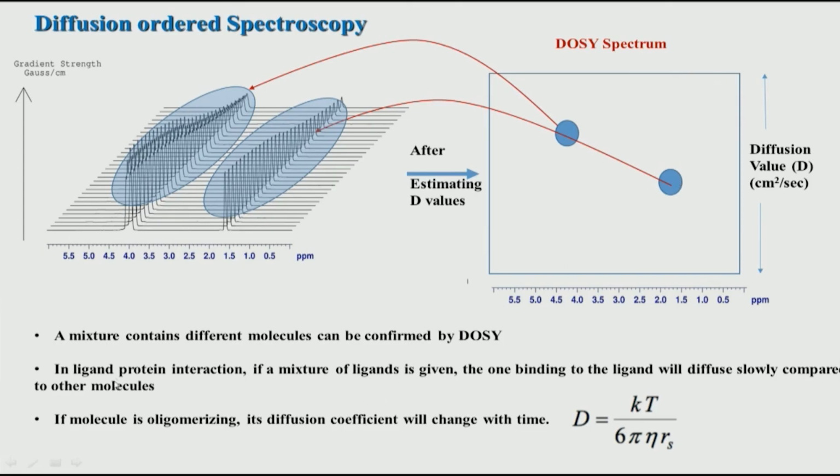This is a typical strategy followed when we try to screen a large number of compounds in the drug discovery process, where the compounds come from a huge library but the protein target is known. So, the goal is to find out which of the ligands or molecules bind to the protein. This is also what we call affinity NMR.